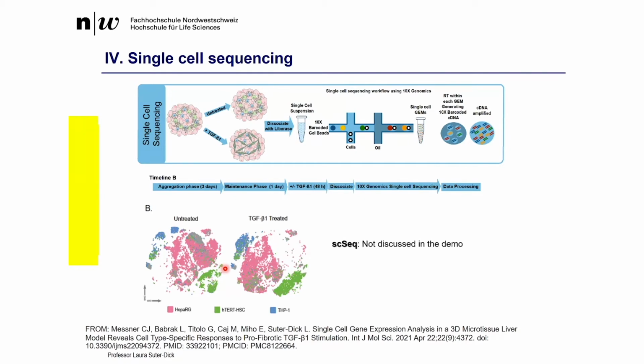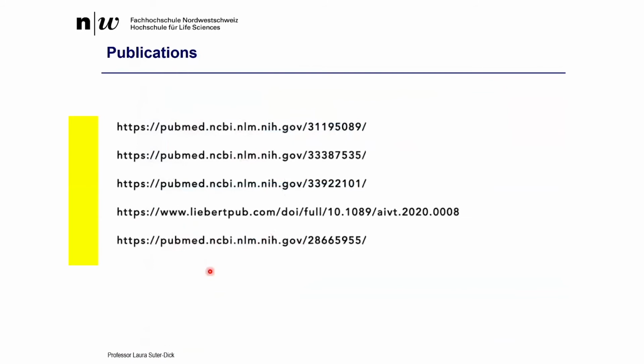So using a 3-dimensional multicellular system is many different things that you can actually address. So all the different things are published in several publications from my group. So if anyone is interested, we can do it later as a follow-up into the different topics. But now we would really like to focus more on the practical approach, and this is what I'm going to try to do now. I'm going to try to get you to the virtual lab.